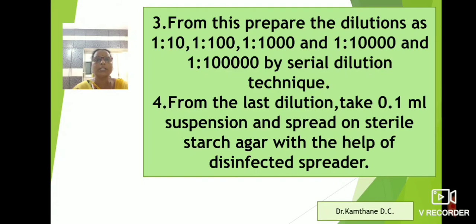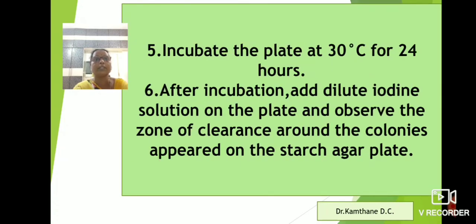From the last dilution, take 0.1 ml suspension and spread on sterile starch agar plate with the help of disinfected spreader. Incubate the plate at 30 degree Celsius for 24 hours.